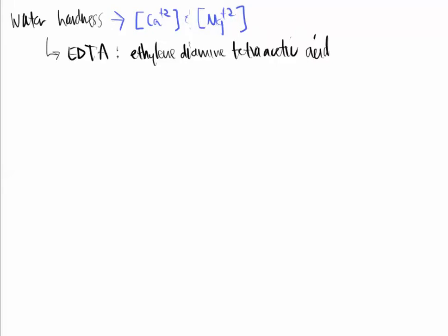Whether you realize it or not, your tap water is full of ions. These can be cations and anions. You've got fluorine in your water because they don't want the teeth to rot out of your head. You have chlorine in your water, maybe due to water softeners, or maybe just due to natural salt intrusion.